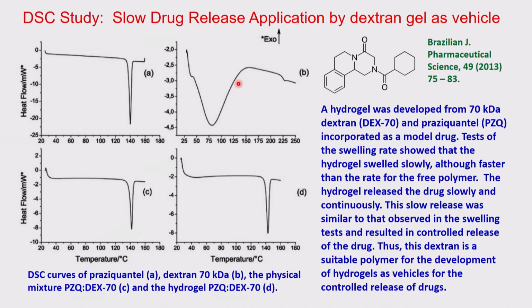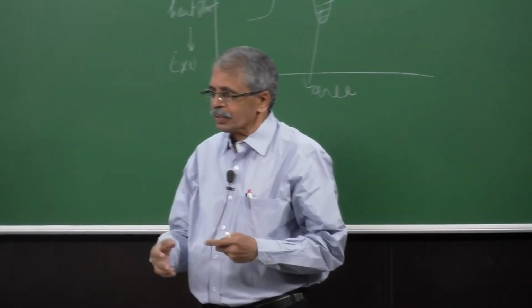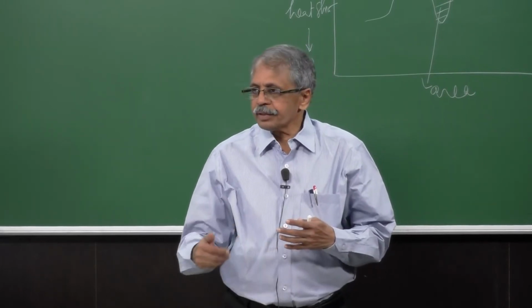In the gel you can see very nicely that your drug is still there. The release has also been studied very well, and the little changes that come are because the drug release was slow, owing to the rate at which swelling takes place during the gel process, and the other studies already done, that is, the swelling rates.